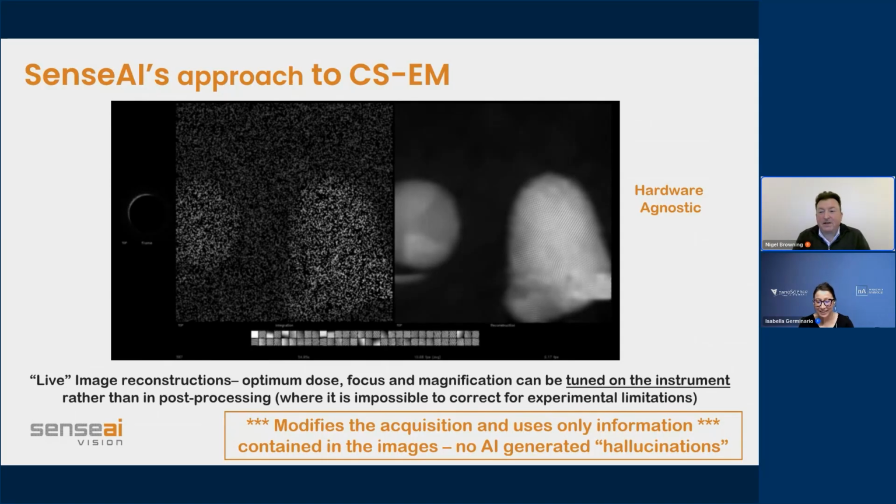All right. So it's a much more nuanced answer than that, and some of it depends on the speed, right? In the way that compressive sensing was originally designed, it would have a completely random set of pixels, and if you were sampling something, you would go from the top left to the bottom right to up and down and around in all kinds of different ways. Now, the problem with that for an electron microscope is practically you have to accurately move the beam to each of those locations. It has to stop in that location, and then you have to move it to another one.